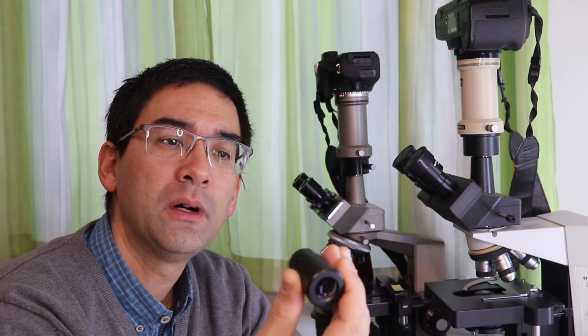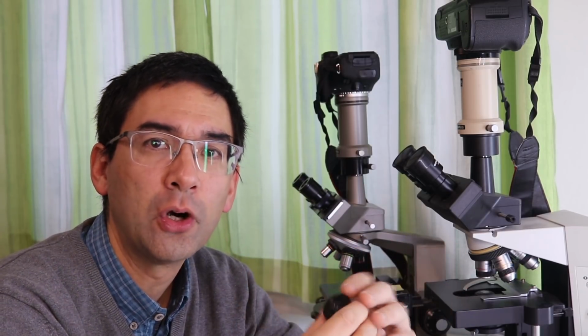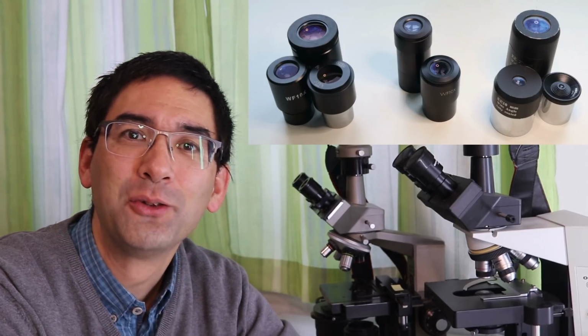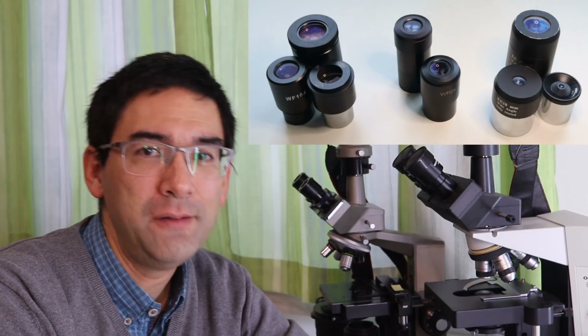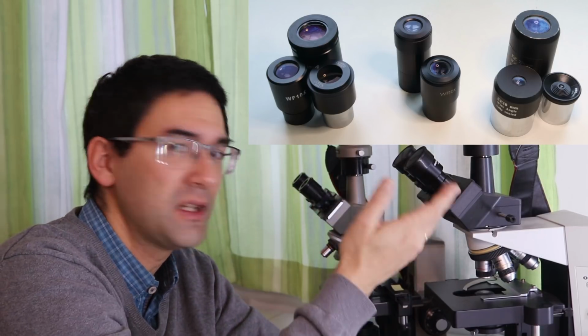There are several different parameters or characteristics that describe the eyepieces, and in this video I would like to talk about these. The first thing is I've categorized my eyepieces into three groups here. On the left you see eyepieces for compound microscopes, so that's basically these ones that you have here.